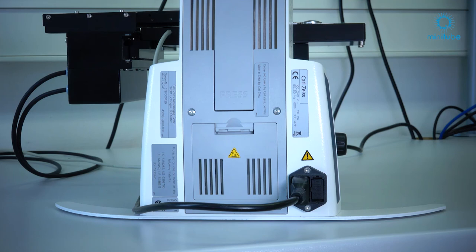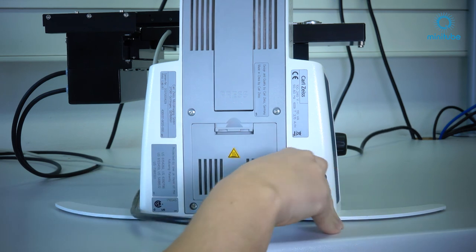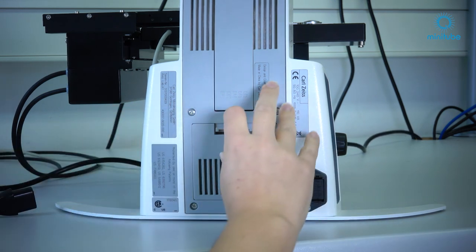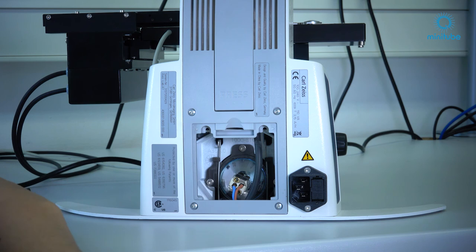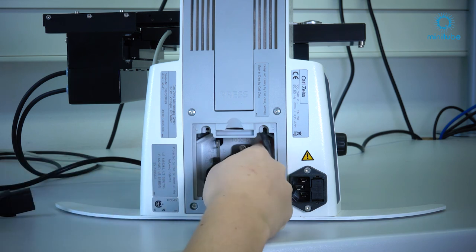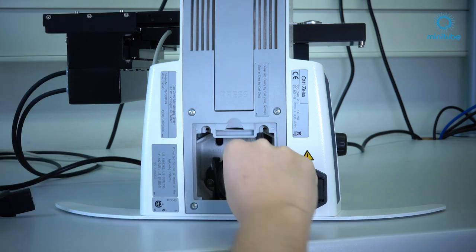To change the lamp in the microscope switch it off and unplug the power cord. Open the cover and remove the lamp by pressing the two metal clips inwards.